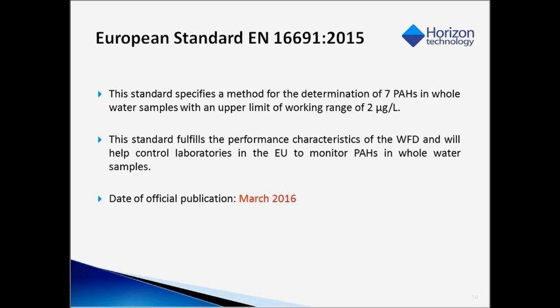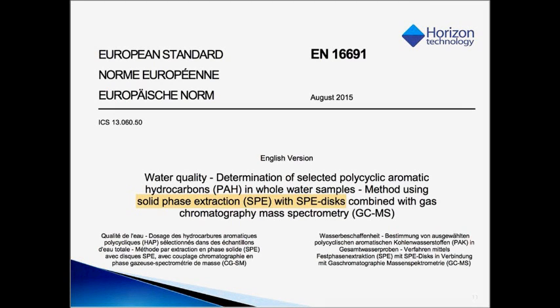So the official date of publication of this standard was in March 2016. So let me go to the next slide. And this is the first page of the European standard. And you can see that the title is in English, but you have at the bottom left the title in French, bottom right in German. It's been translated in a few languages at least.